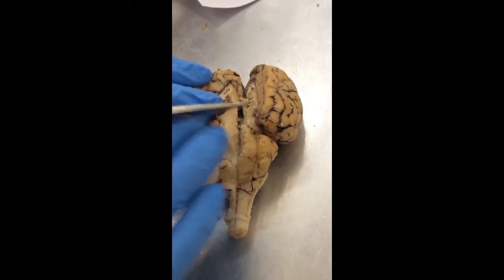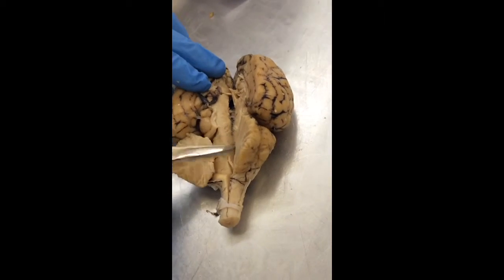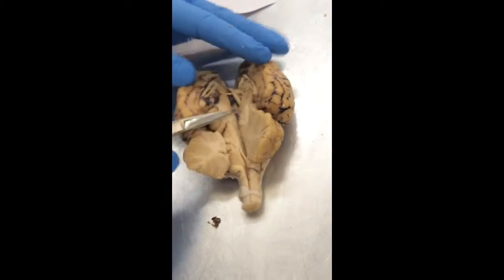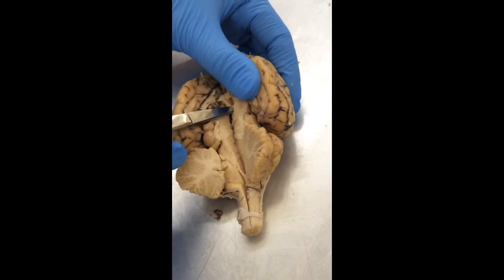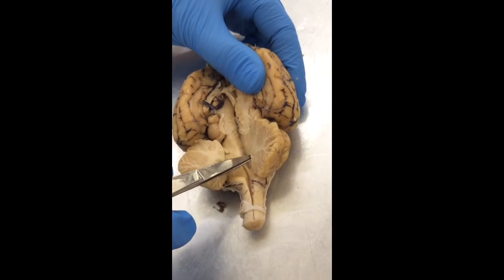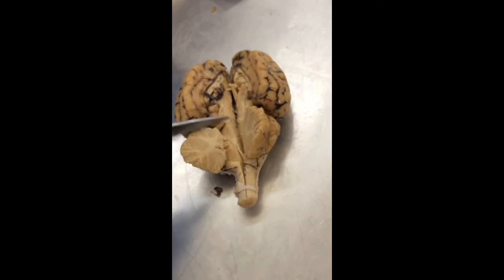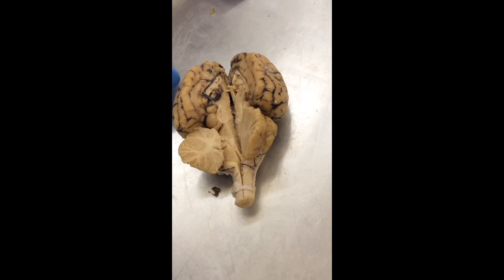Now, your fourth ventricle, believe it or not, is right here. It's across from the cerebellum. So how does the third ventricle, which is here, drain? There it is, the cerebral aqueduct, draining down to the fourth ventricle. There's our beautiful tree of life. And I think we got everything.